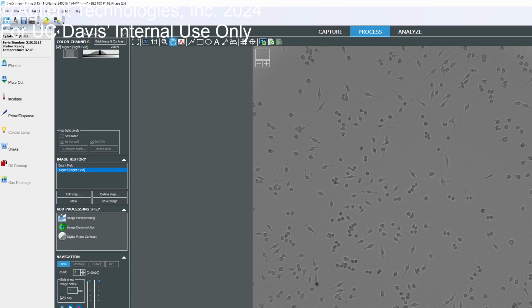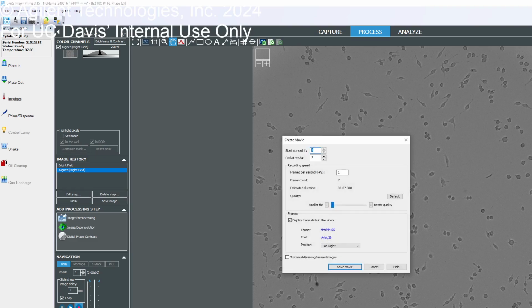And then if you want to save this video for now, you can just click on this record button, which is next to it. And this will save your video. And then I always look, I don't know why this is set in like smaller file size. You always want to use the highest image quality. So I use that, and this is the frame rates, and you start saving.